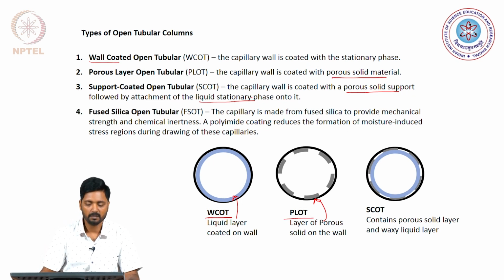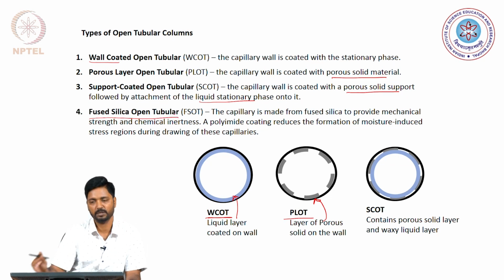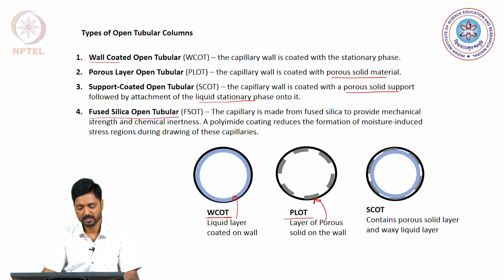A revised version of the open tubular column is what is known as the fused silica open tubular, or FSOT.